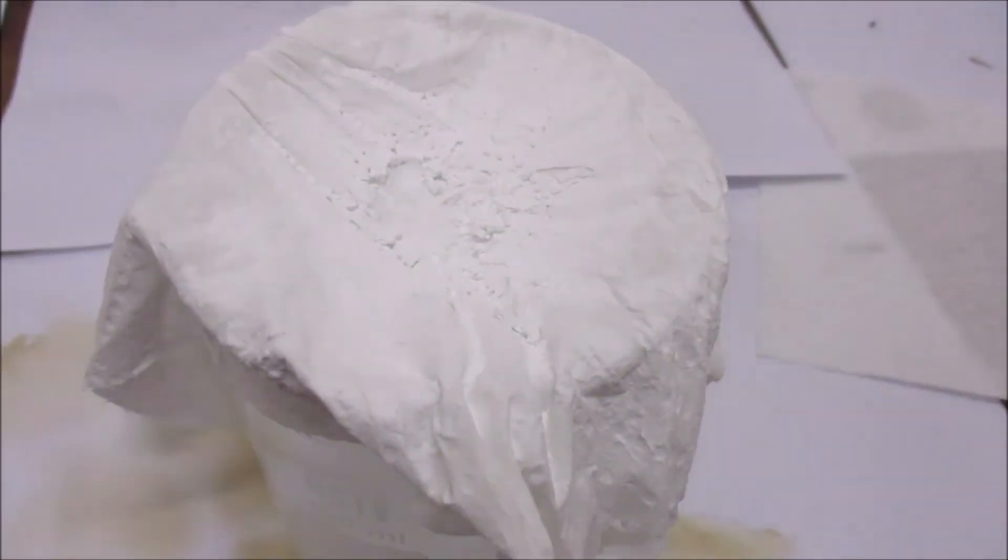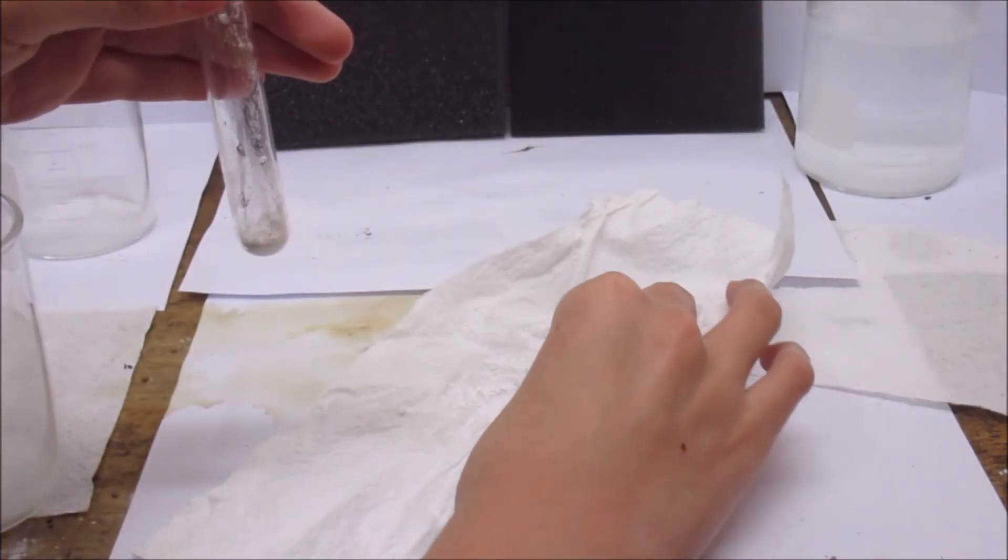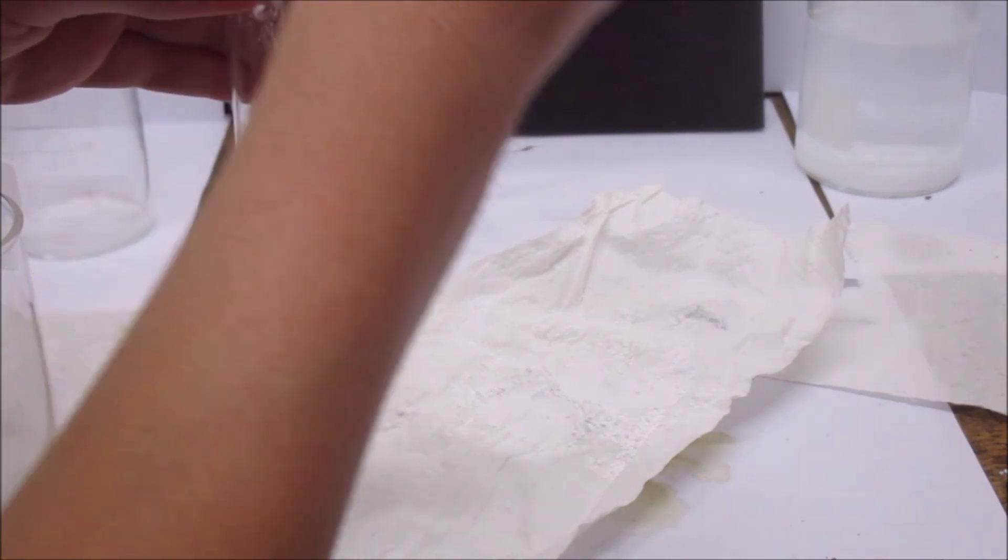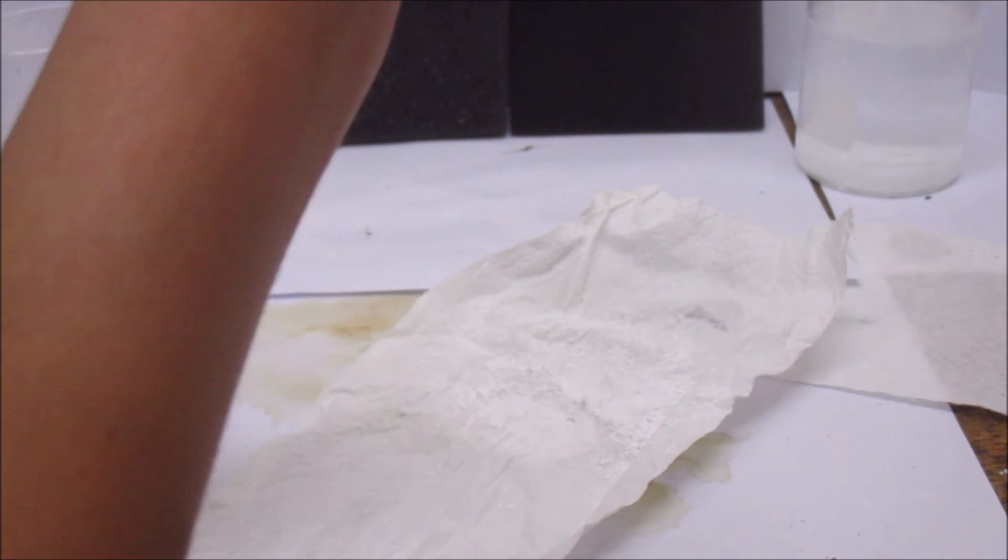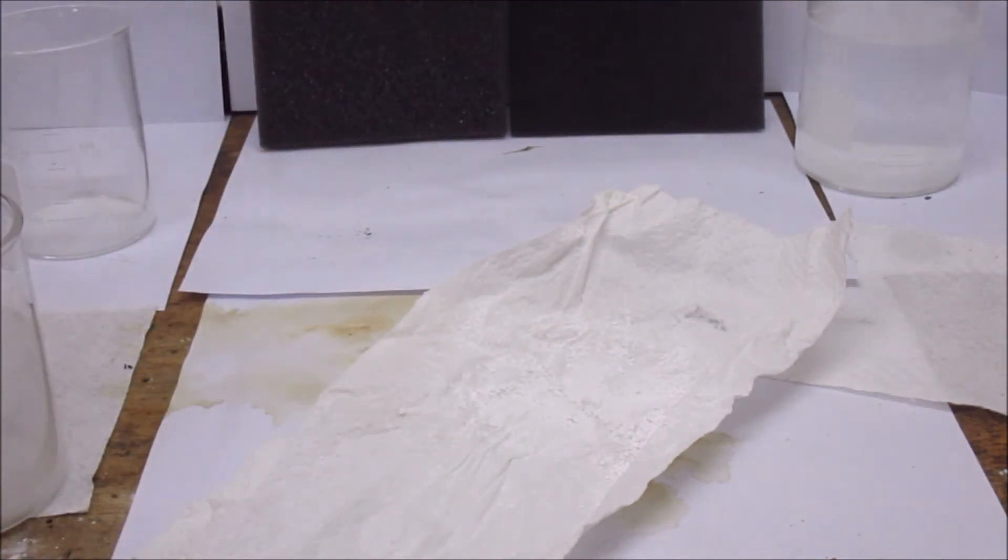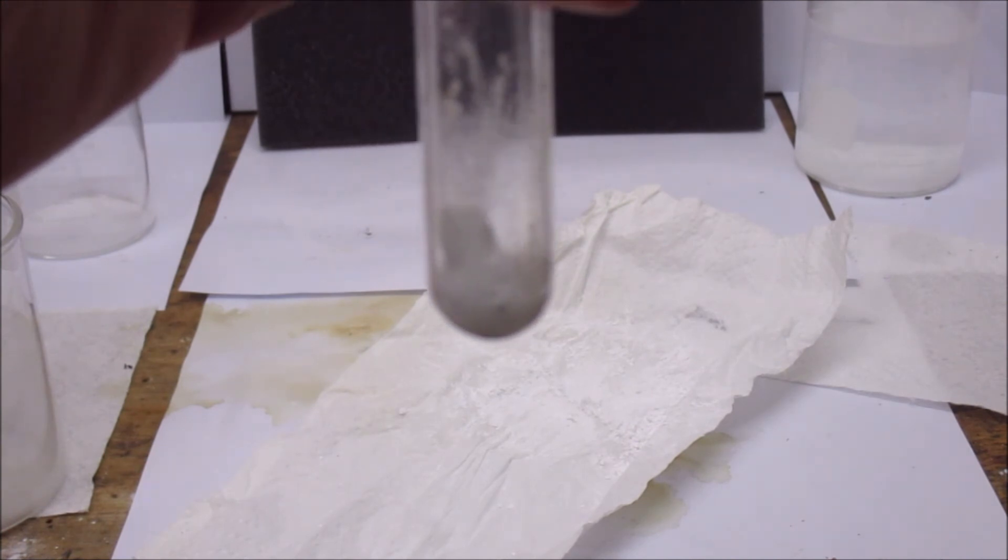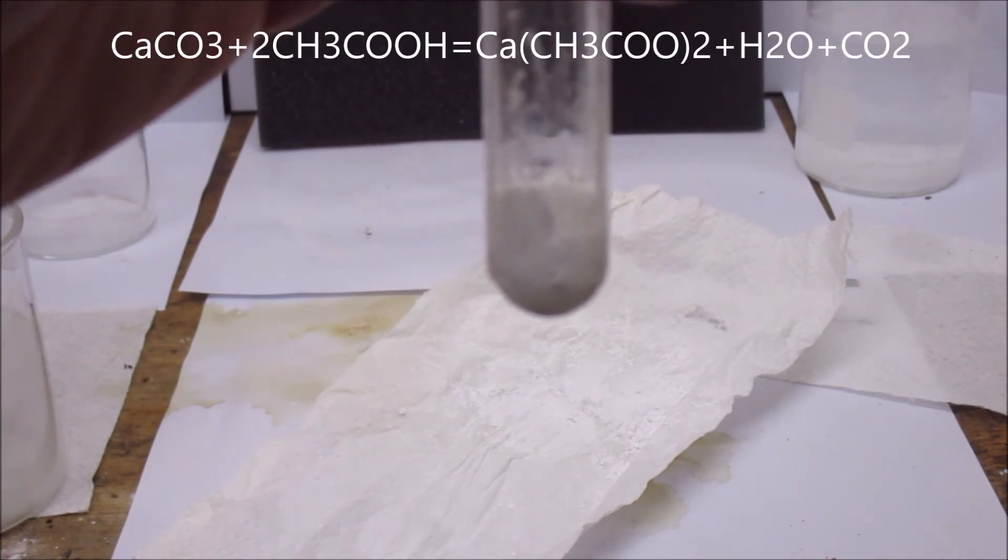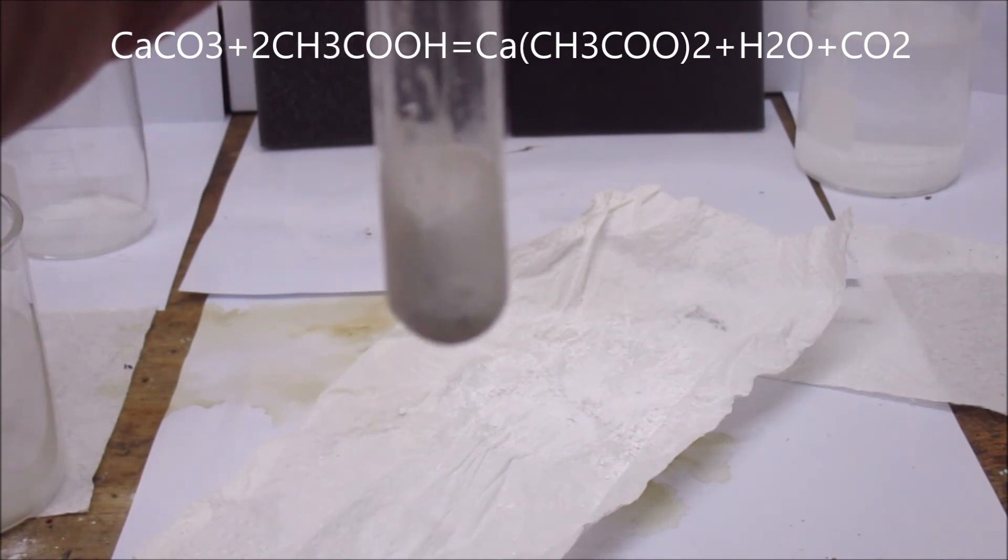I then let it dry and I was left with a nice white powder. I added a little amount of the calcium carbonate to a test tube to make sure it really was calcium carbonate. I then added a little bit of vinegar, and now you can see the bubbles forming from the reaction.